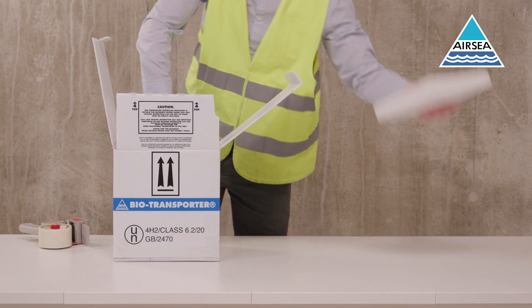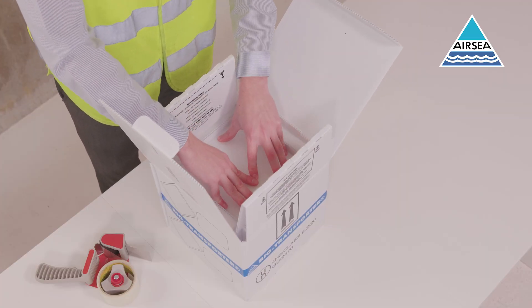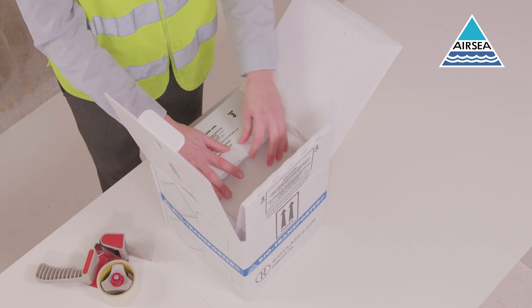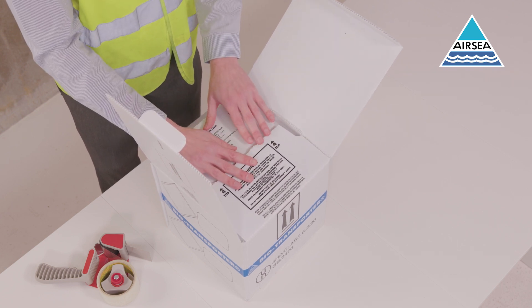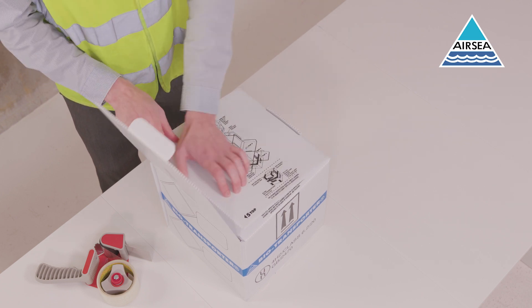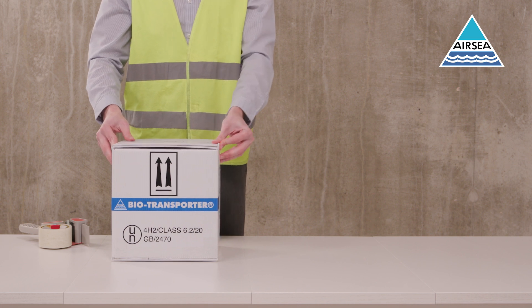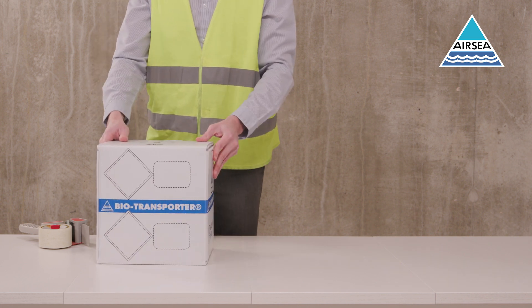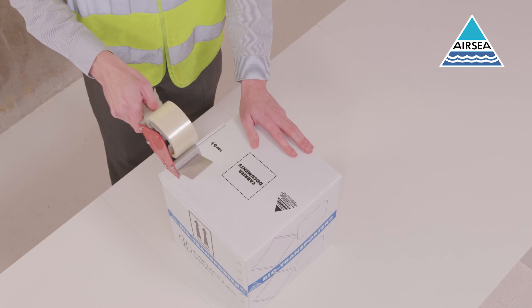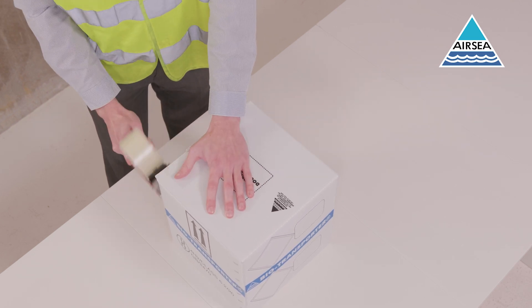Add the foam top. Close the box in the order printed on the flaps. Seal the exposed edge of the box using two strips of 75mm tape.